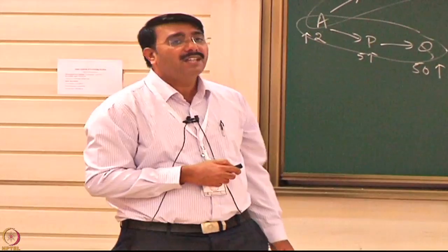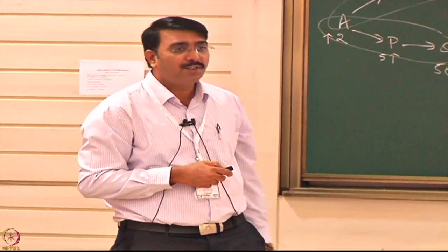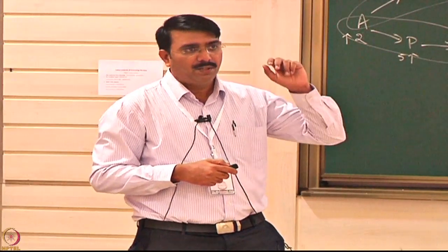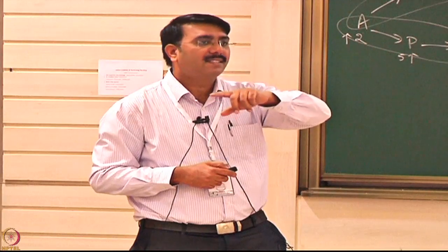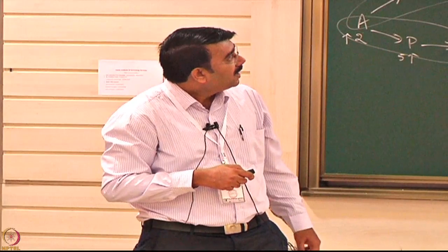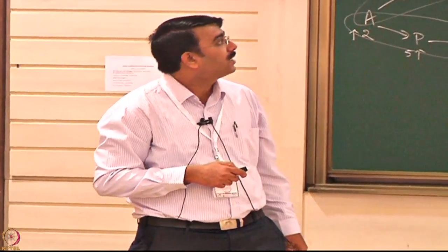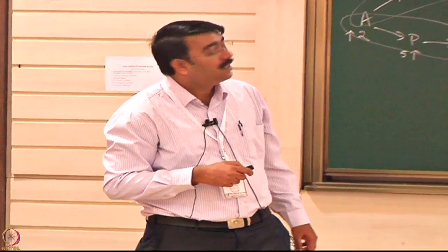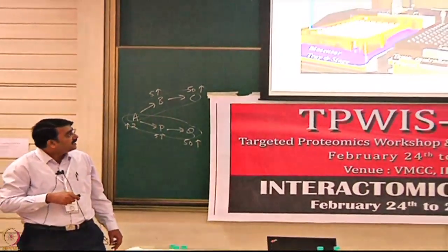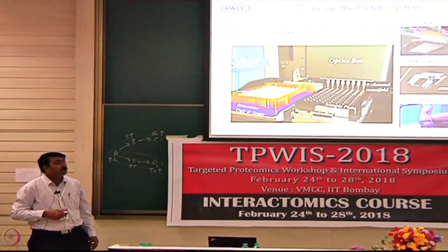When it comes to high throughput, we have different channels. In SPR, there are four-channel and two-channel instruments, where four-channel means you can pass three analytes and one acts as a reference. Here we have an eight-channel instrument, so eight interactions can be measured simultaneously. That is where the throughput comes from. We have a 96-channel instrument, where 96 interactions can be performed in one go, and a 16-channel instrument, where 16 interactions can be performed in one go. We also have single-channel and two-channel instruments.